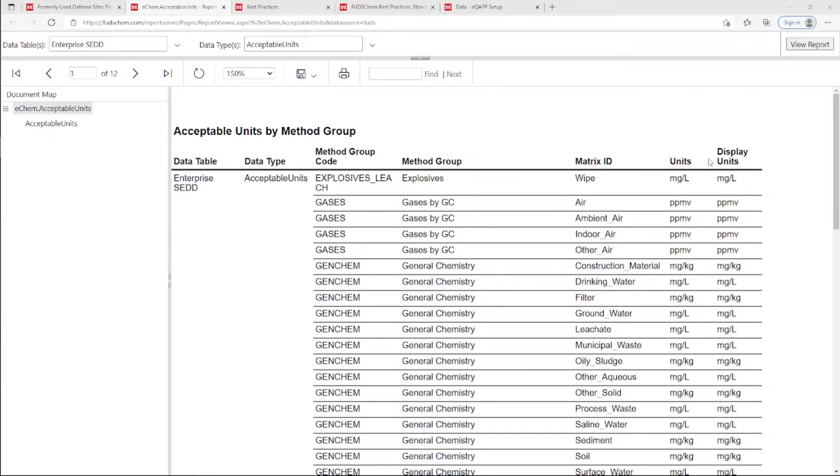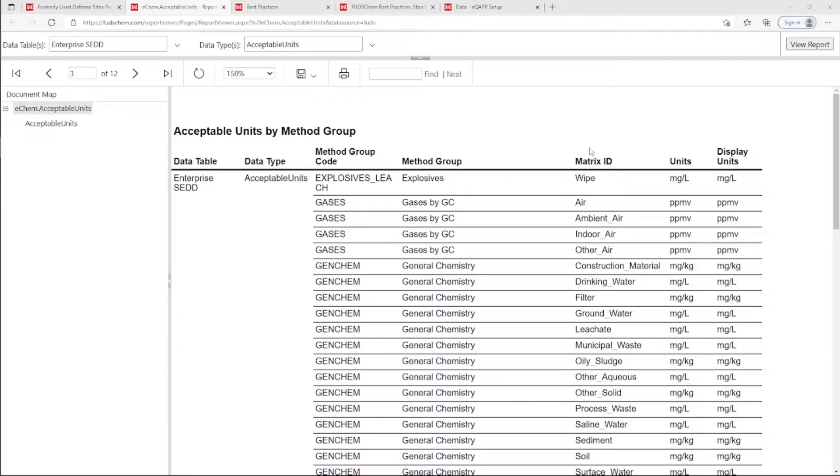While the units themselves can be converted, the combination of Method Group in the EQUAP and Sample Matrix loaded by the Lab in the EDD will need to match what is in the report so that the system recognizes what the Acceptable Units should be.